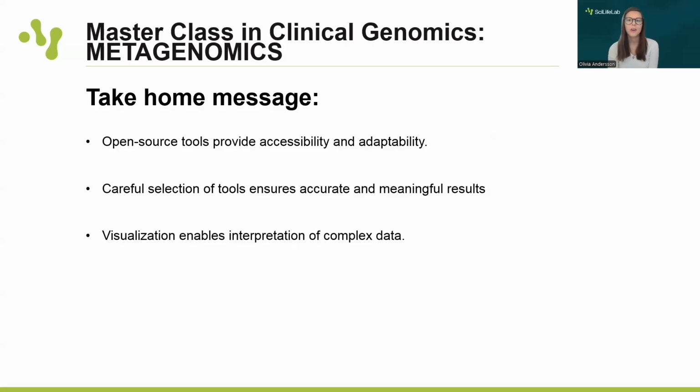And these visualizations not only make the complex data accessible, but also enable the identification of specific pathogens while providing a broader understanding of microbial compositions, adding valuable context for both research and clinical applications.